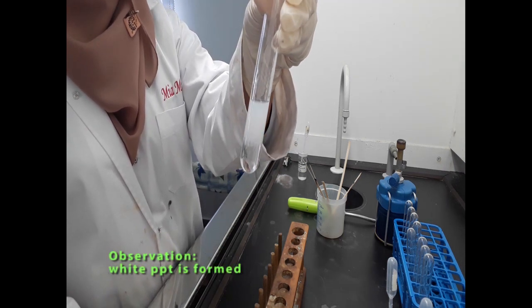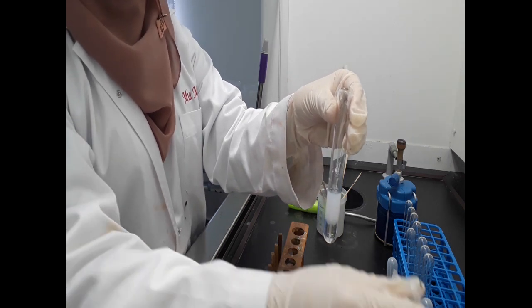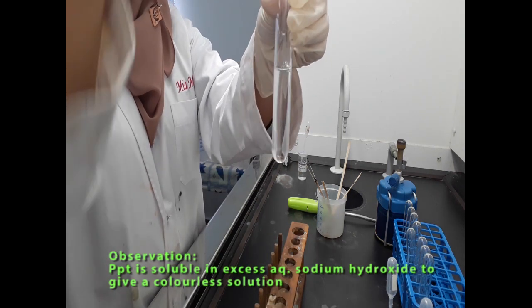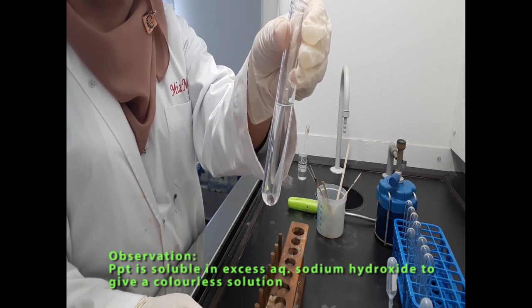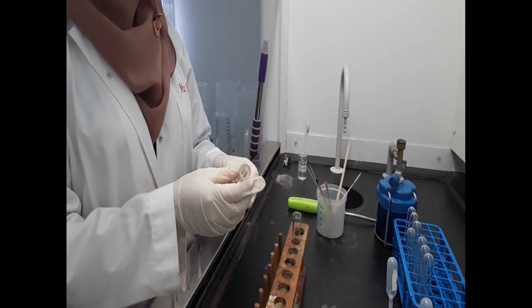White precipitate is seen. Okay, to this, I need to add an excess aqueous sodium hydroxide. The white precipitate dissolves in excess, giving a colorless solution. From the QA notes, the ones that give white precipitate and are soluble in excess are aluminum and zinc. Let's move on to solution S.